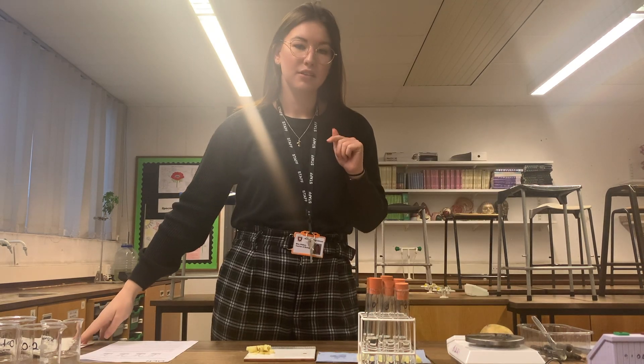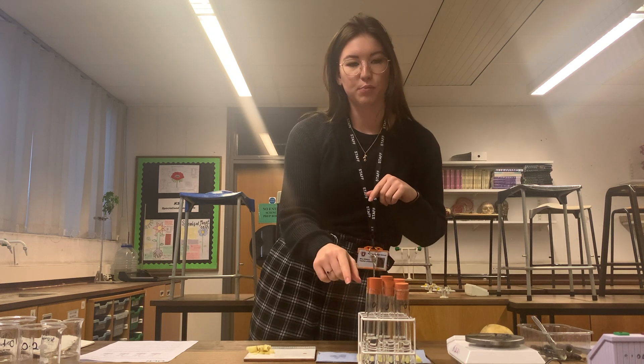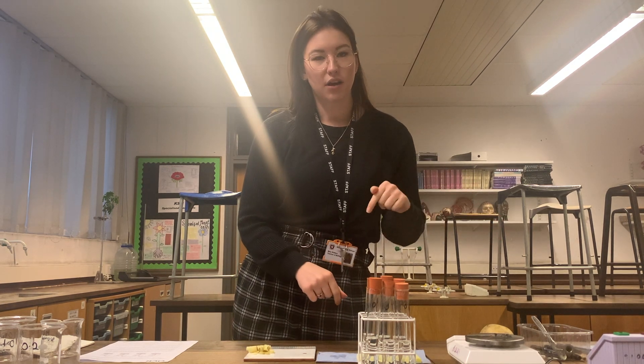The method says to roll the potato cylinders in paper towel three times each, and it's important we do the same for every one so that it's a fair test. They're rolled and dried, so next I need to weigh each of them on the balance and record their initial mass. With initial masses recorded, I'm now going to pop a tube of potato into each boiling tube, start the stopwatch for an hour and I'll come back later.